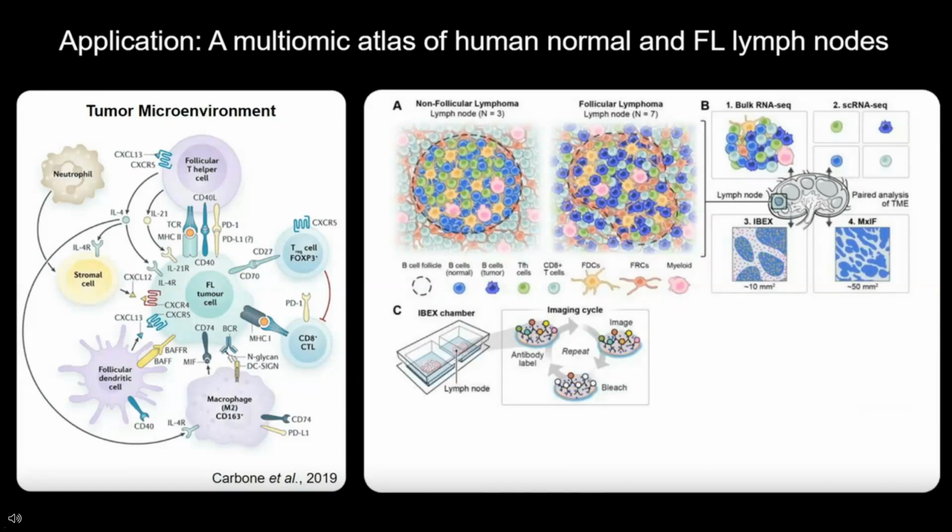So you're familiar with Ibex now. Again, we're performing the manual method in the imaging chamber using rounds of antibody labeling, imaging, dye inactivation, keeping one or two markers as a fiducial, showing that little red circle, and then antibody labeling and imaging again.